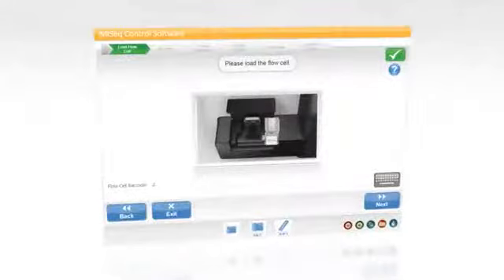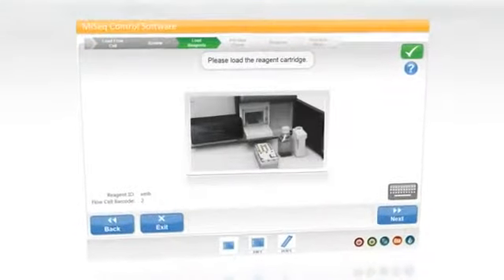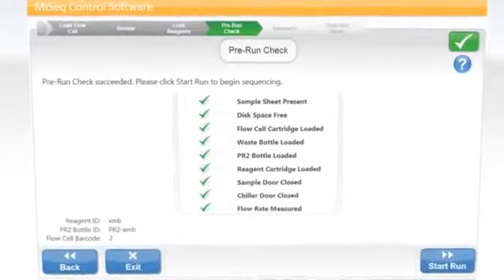In any run, a user will be given guided instructions with context-specific help to tell them how to set up a run parameter, how to load a flow cell, how to load the reagents—basically how to get everything ready for a run, and then it will do a pre-flight check.